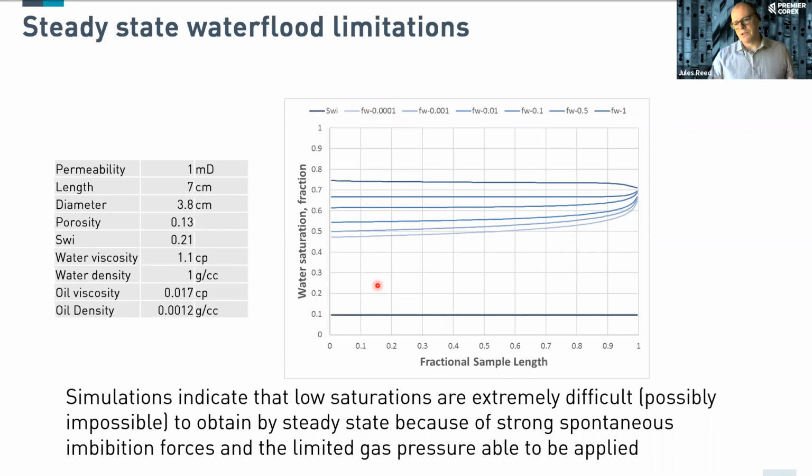So one of the methods that you might use is to exchange gas for decane or some light alkane, heptane, hexane, or something similar, and perform it with that, because then the liquid, although it's non-wetting, will have some resistance against the water.